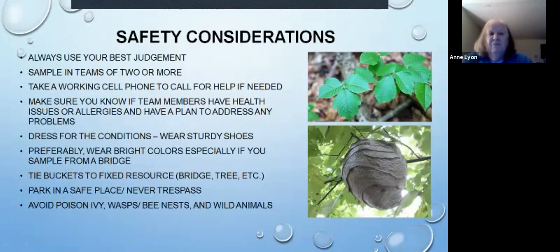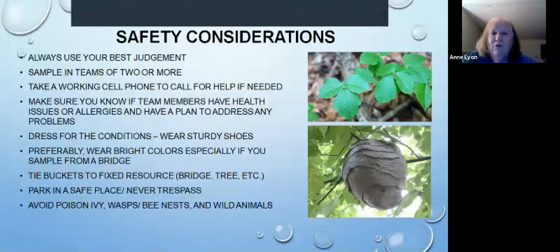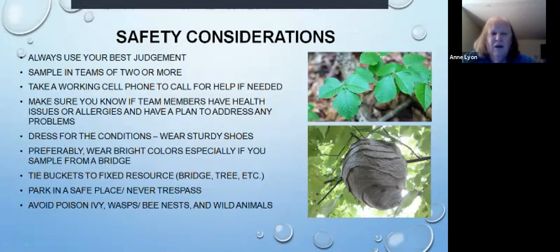Safety. I always start with use your own best judgment. If, for instance, we have a weather event and we have flood conditions and it's not safe, we prefer people over samples. So if you don't think it's safe to sample, don't sample. We'll sample it the next time. We try to sample rain or shine, but not during really serious weather events.